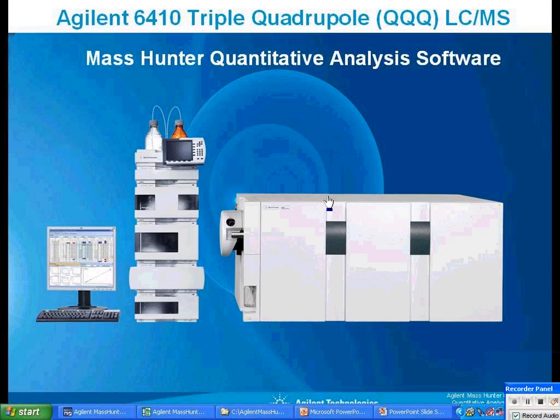Hello. I'd like to talk about a tool which helps you optimize the conditions for your MRM transitions. Now, there's a number of ways to go about this process. One, for example, is to sit in front of the instrument, infuse a compound, and then you can optimize your fragmenter, find that correct, and then move on and do your collision energy. That can be very effective. What I'll show you here is a more automated way to run a number of samples by injection to try to accomplish that same goal.